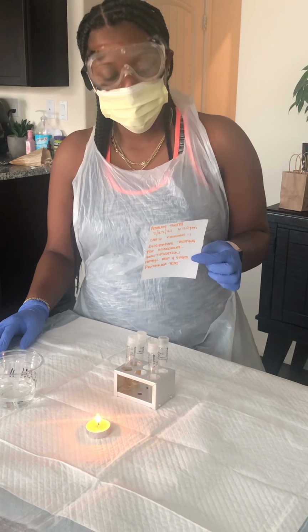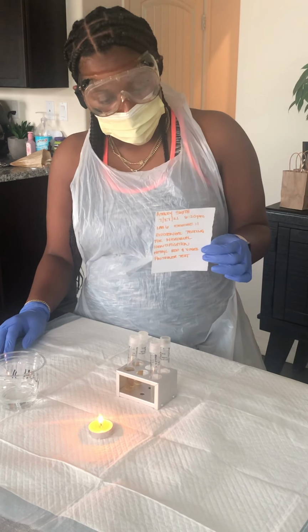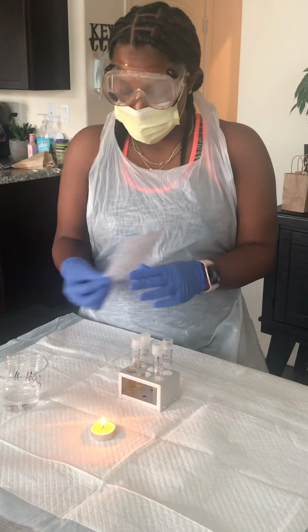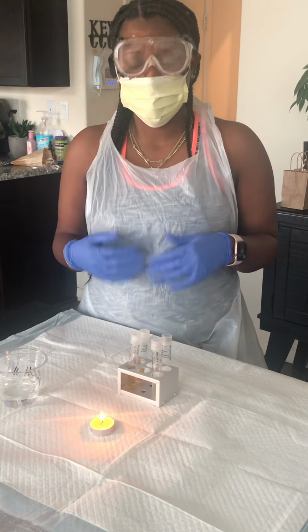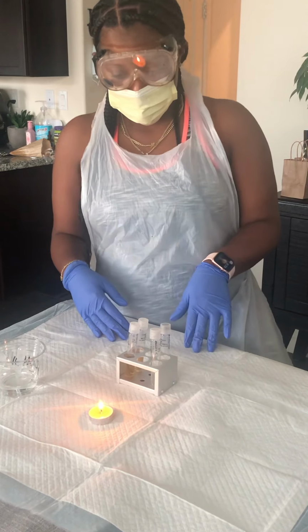It is 6:20. Today we will, this is actually Lab 6, Exercise 1, biochemical testing for microbial identification. I have my setup here. I disinfect the area, applying my PPE on, and now I'm ready to get started with our exercise.